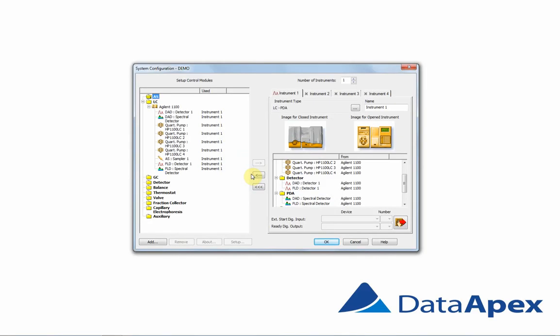I have already configured Agilent 1100 HPLC system with FLD and DAD detectors, autosampler and pumps. However, for a different type of analysis, I need to use only FLD detector or DAD detector alone. It would be time consuming to always change it in the system configuration. Luckily, Clarity has something called Launch Manager, which offers this functionality.